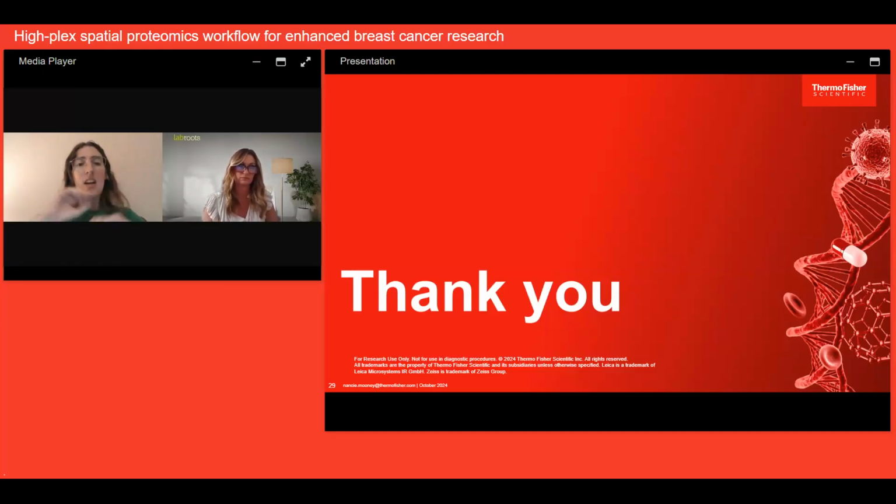This is the R&D scientist, not the spectral unmixing mathematician. So again, please find the other resources as well, but let me take a stab at this. So the EVOS S1000 is a spectral imager, which means that it's not just taking the single picture of the fluor of interest, it's also taking images in different parts of the spectrum to enable the unmixing of the spectral fluors. So it's taking like a full fingerprint, not just one image in each.